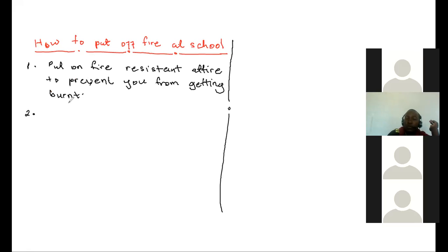Step number 2, you have to get hold of a fire extinguisher.